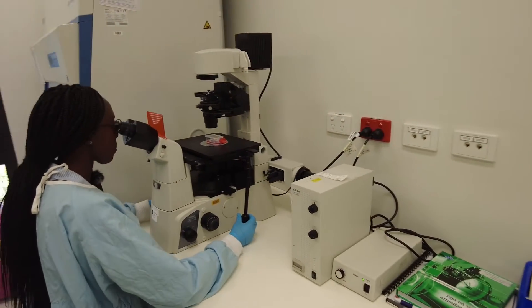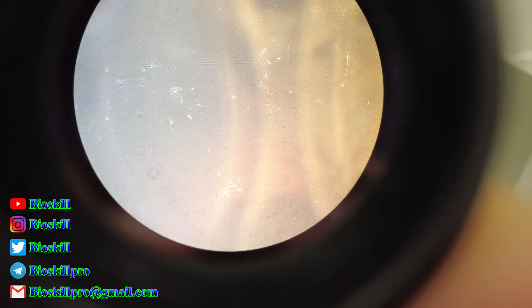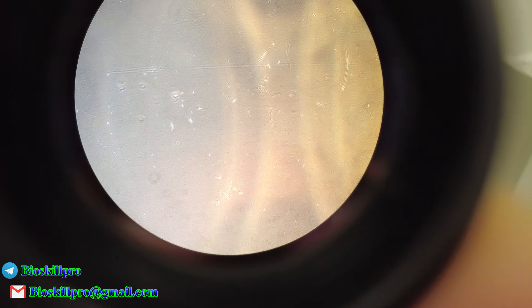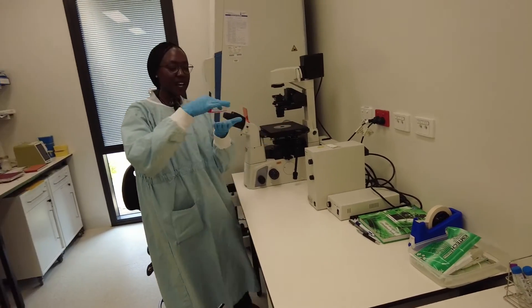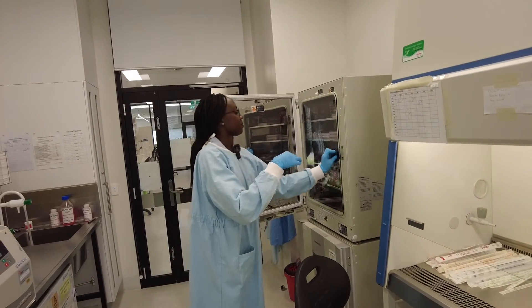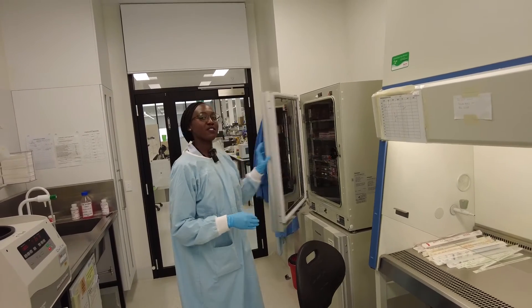Looking great — now you can see it's clear. We place our flask in the 37-degree incubator at 5% carbon dioxide, and we'll be back in a couple of days to double check.